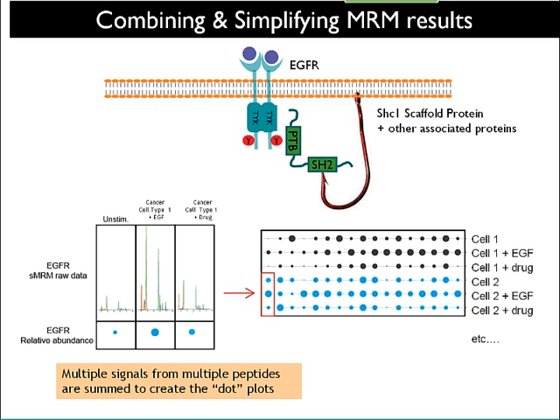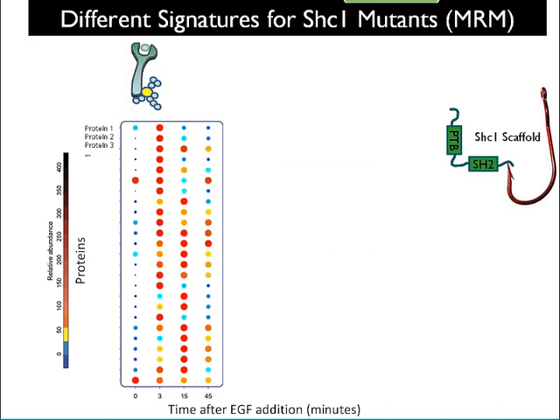And from that now, we can create all sorts of large arrays of patterns that people who don't really care about the nuts and bolts of the mass spectrometry can start to understand. Because when you have a relative amount of a protein, or an absolute amount, from a cell line compared to one condition to another, biologists can really start to construct theories of what's going on here. This reads like a book to them. And from the relative amounts, you can try and tease out mechanisms of cancer. You can tease out a variety of things.